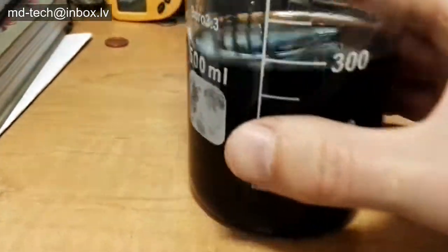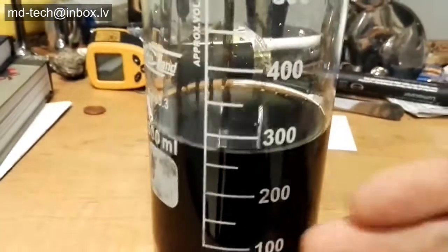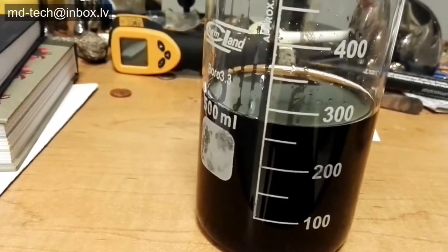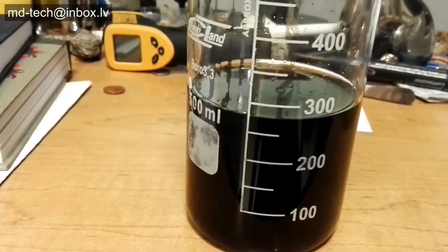Hello friends! Today I show how to precipitate palladium, platinum, rhodium metals from solution. This method is simple and very fast, and works on very dilute solutions.